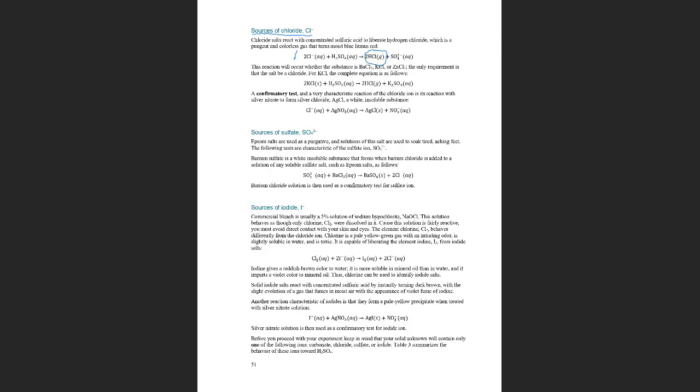I said at the beginning that litmus paper with acids always turns red. So that's a way of saying, yes, I have an acid here, which is hydrochloric acid. And we can have any salt. When we add sulfuric acid, what's important is that we have the chloride.